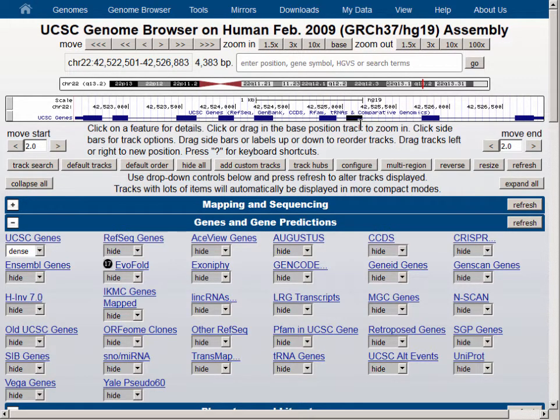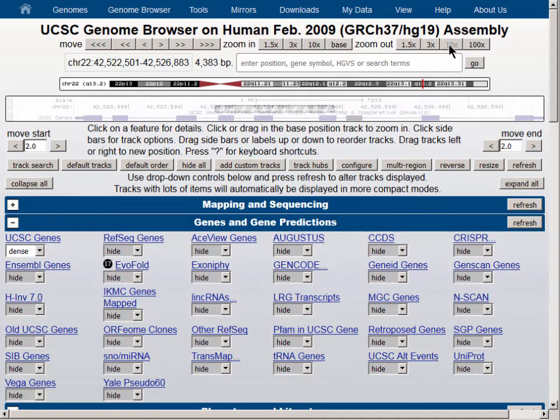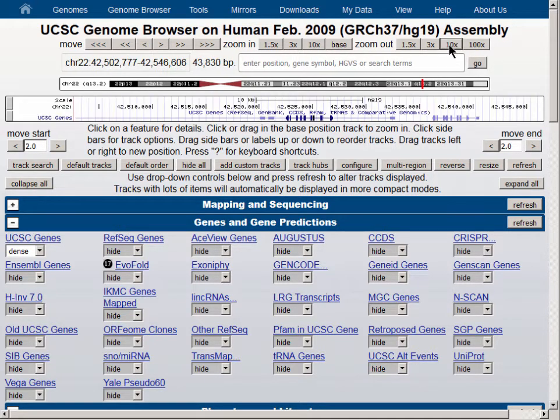Let's zoom out by a factor of 10 and pick up some nearby genes. You can see that in dense mode there are no labels anymore, and everything is essentially squeezed into a single row. We are displaying only the footprint of the genes on the genome without any detail.